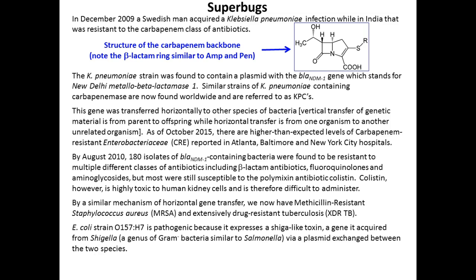Viruses can infect bacteria. They can pick up DNA and transfer it to another bacteria. That's called transduction. What we're doing today is we're just putting DNA into the environment, so we're doing transformation, where they're going to pick it up and they're going to transform, they're going to change based on that genetic information. They're going to get new abilities.